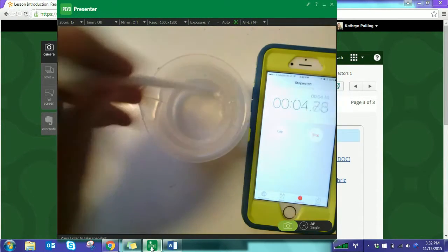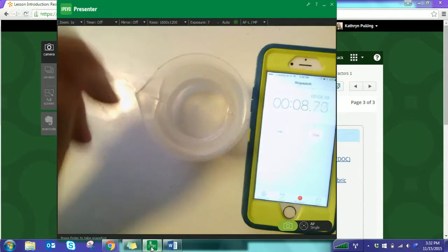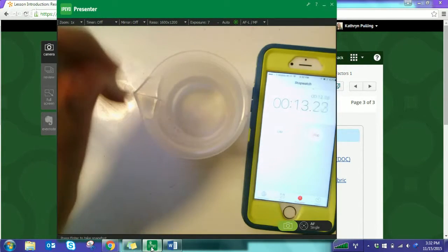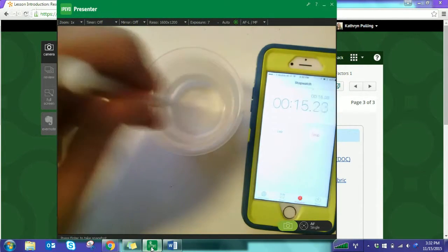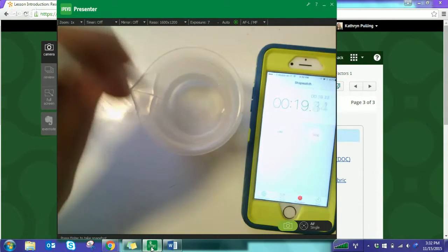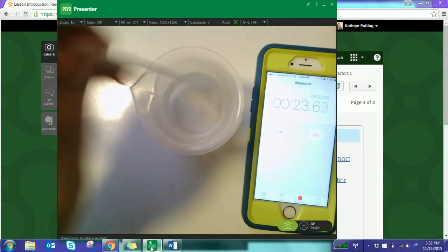The solution turned kind of purple brown before, and we're going to keep stirring until that happens again. There's no indication that there should never be a reaction, just some of these might take a while. Or maybe this one will be faster, who knows?